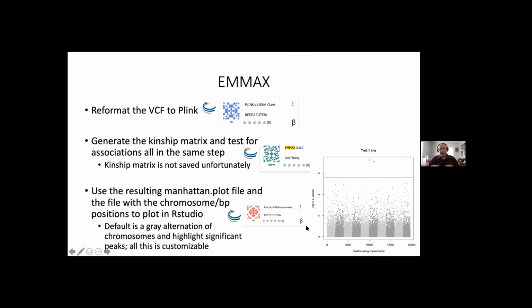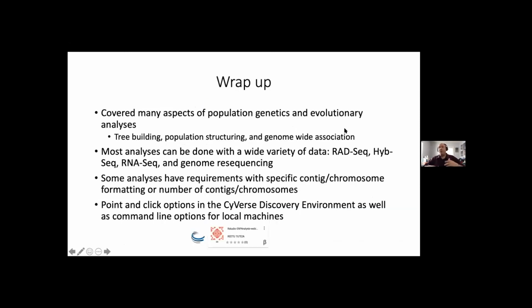This whole pipeline, though, is fairly customizable to what you want to do with your data set. It's just kind of an example of what we can do. So I know I covered a lot of material. It seems like this happens a lot with these webinars, but you can go back to it. You can look at the tutorial to really get a very good feel for how to go through some of these analyses, both in the Discovery Environment and also in the command line version.